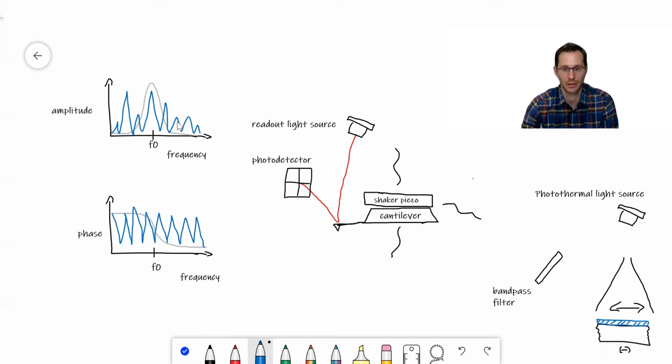And the second one is that because it's a combined response of not just the cantilever, but also the medium and the structure, it's quite sensitive to changes in things like the amount of fluid that's there or the temperature of the fluid. And so as an experiment goes on, and say the fluid evaporates, if we're working in liquid, then these peaks can change quite drastically in size, which makes it not a very stable way of exciting the cantilever.